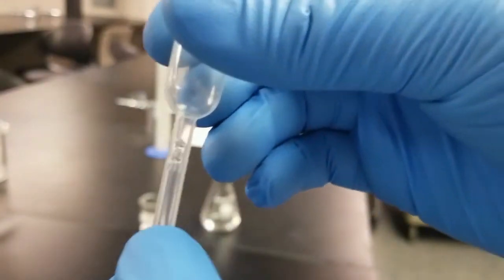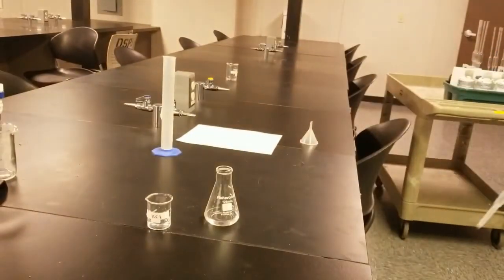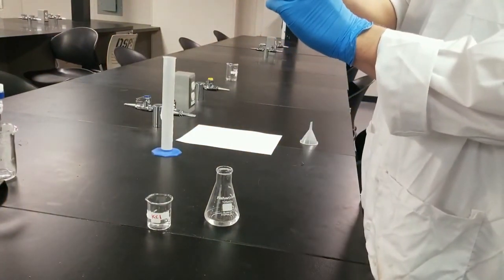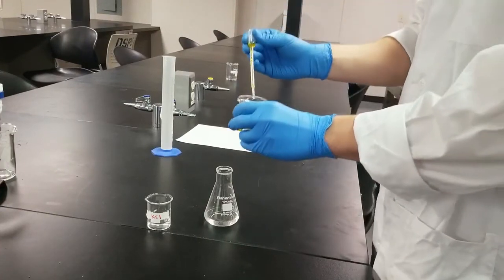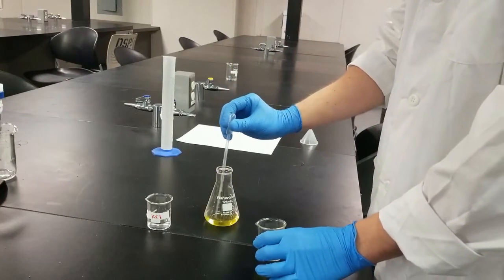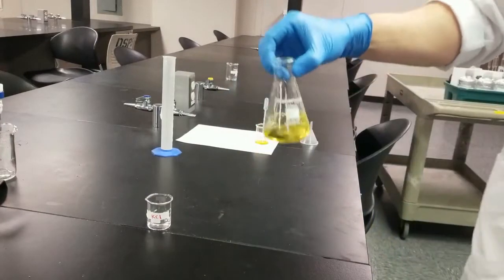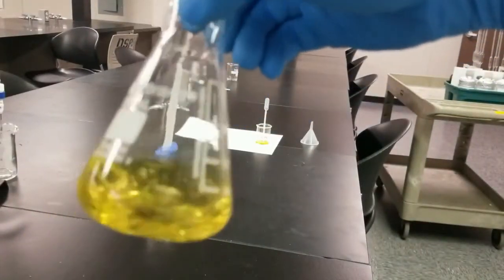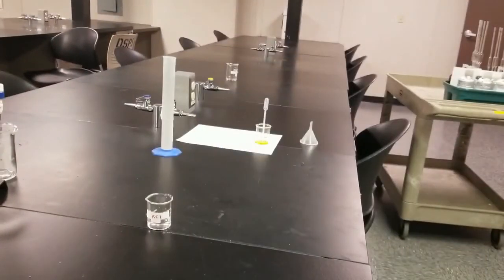So I don't know if you can see this pipette bulb, but this reading right here says 1 ml, so we'll just fill it up to there and pipette approximately 1 ml. And as you can see, our solution is this nice, bright yellow. And now we are ready to get started on our titration.